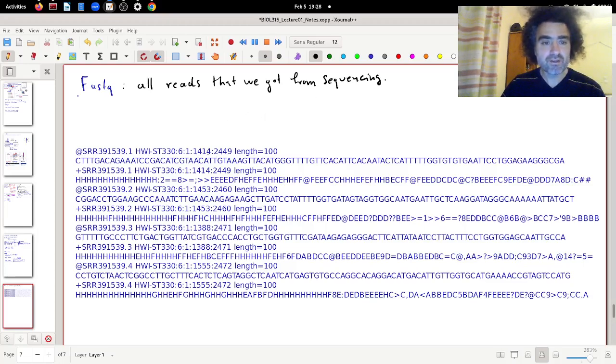So in fact we expect to see DNA data here. Instead we see some other lines as well. Now I will explain what they are. The read information, so the sequencing, comprises one entry. So one read is actually one entry here. And this entry carries different pieces of information. Actually 4 pieces of information.